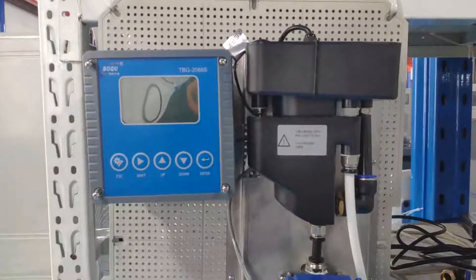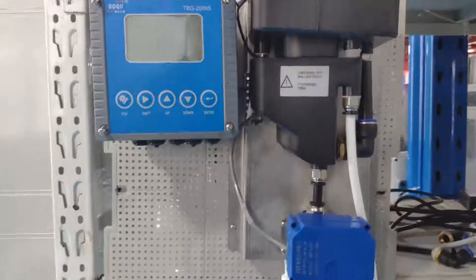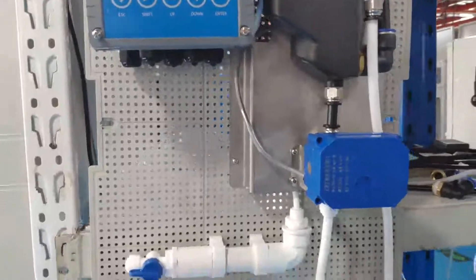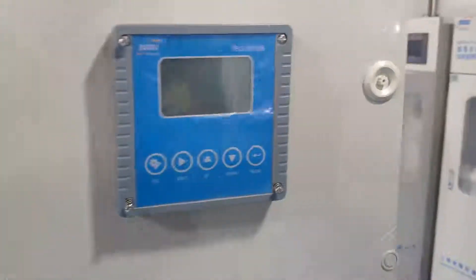This is a flow cell turbidity meter used for low-range turbidity measurement, like at a drinking water plant. We integrate it in a plug-and-play way so customers can directly use it when they receive the goods.